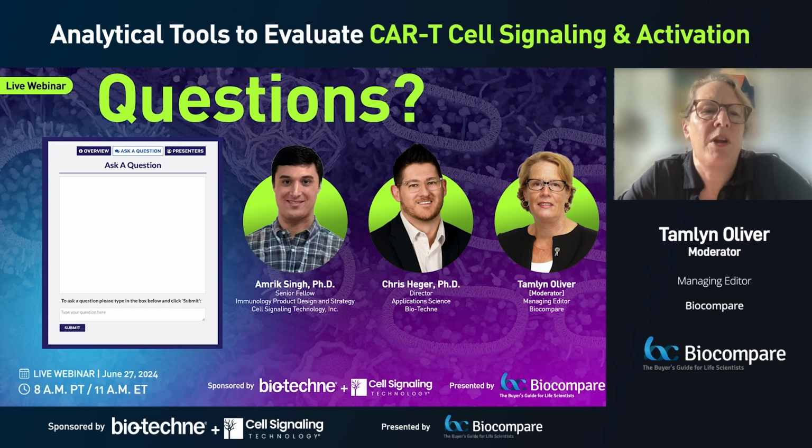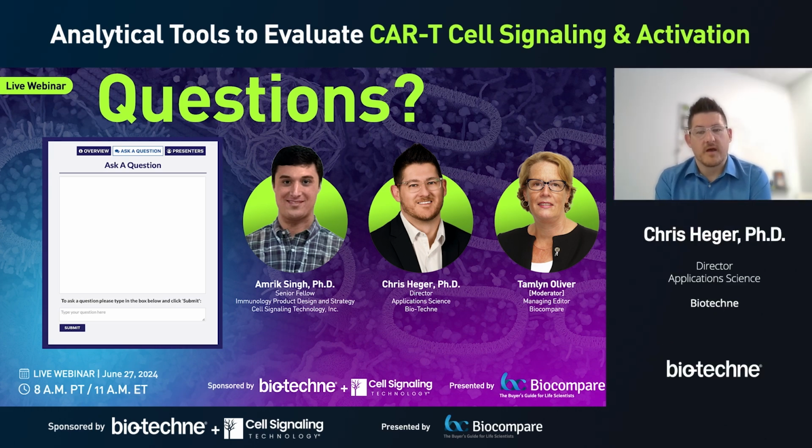How many copies are integrated into the genome using TC Buster? Yeah, so the TC Buster platform, again, if this is your first time hearing about it with us today, it's our non-viral gene editing tool, and essentially has no limit on packaging sizes. And as we showed today, we introduced a tricistronic construct for the various components that we used for the CD19 CAR. We typically expect 5 to 7 copies. In those experiments, we didn't measure it in this exact run, but that's pretty typical for the TC Buster platform.